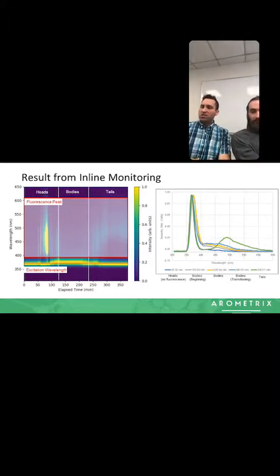And what you see, first of all, is there's a few important things to note here. In the heads, we're pretty colorless up until this really large yellow blob, very broad, between about 400 and 525. And that's not necessarily expected. But what you're seeing here is when this heads was run, it was run directly after the tails of a previous process.